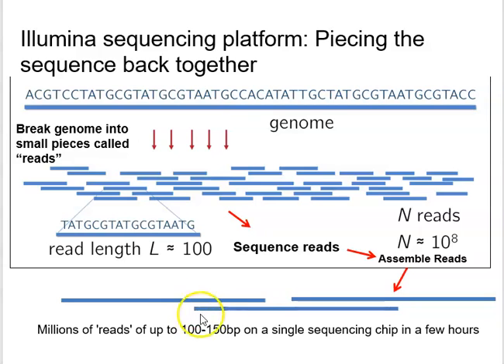Now if there is an overlap of about 20 base pairs from here to here, that sequence should only occur once in the human genome, so we can quite confidently say that sequence there and that sequence there are effectively overlapping with each other. Then this sequence here matches this little bit, so this must go next, and we just build up the whole sequence that way.